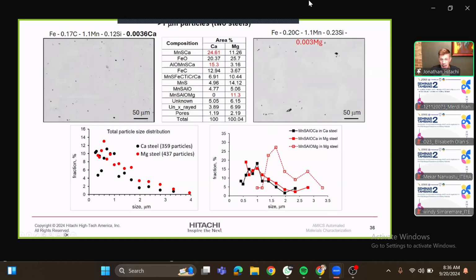And pore analysis as well, right there from within. So here's precipitates, here's some pore analysis from steel, also absolutely excellent data. And so we can extract what are the pores, what is the pore distribution, the size, and the aspect ratio of those pores. And she's going to hand it over.